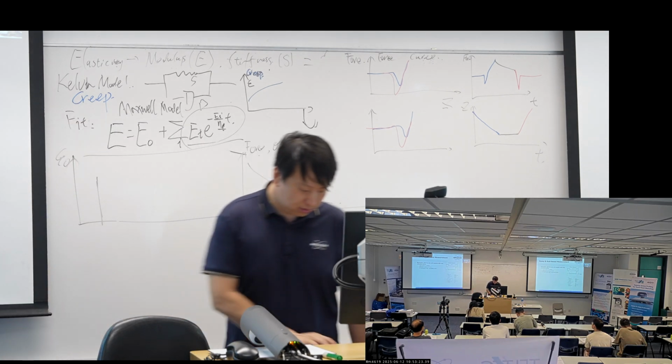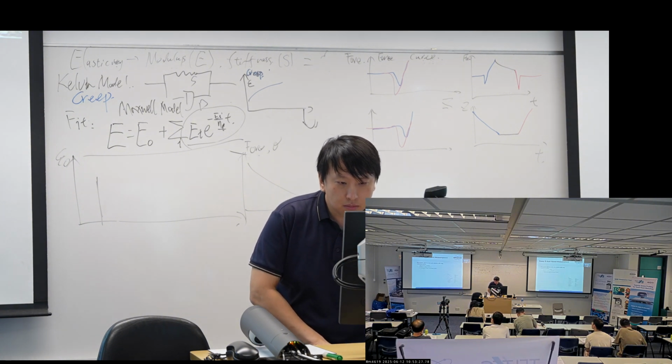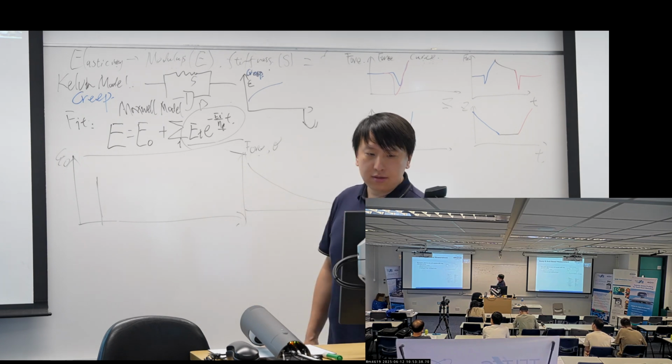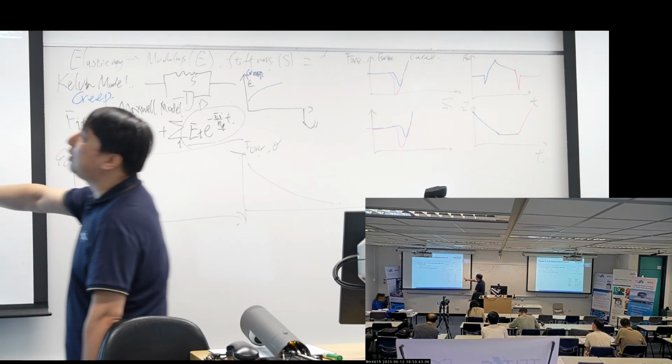And so our experiment setup is something like, no, this. Huh? The slide is messed up. Yeah, sorry, the slide is messed up. Something wrong about here, but I will explain.